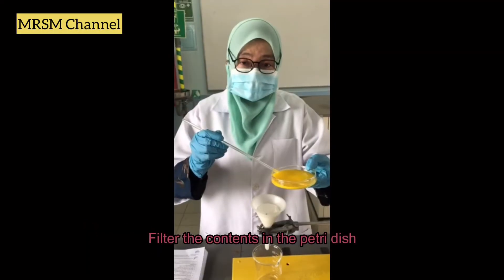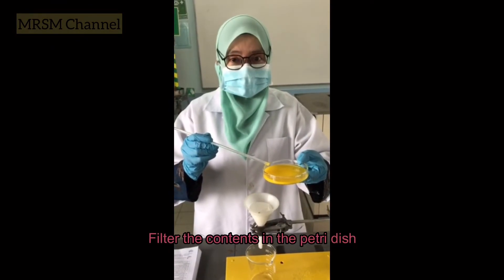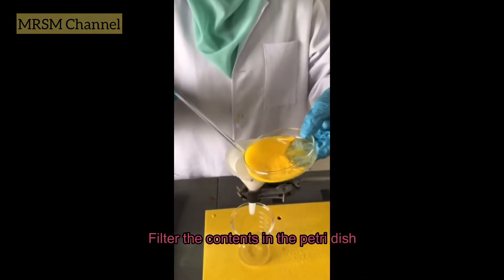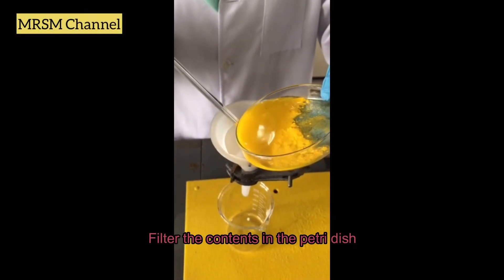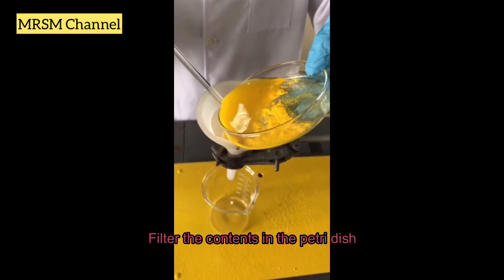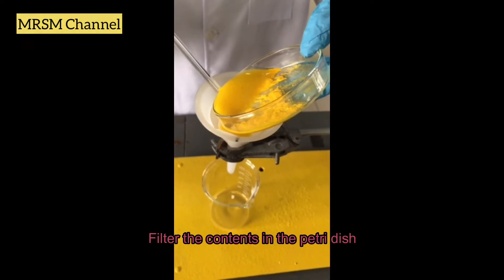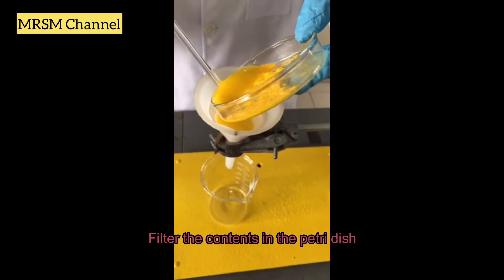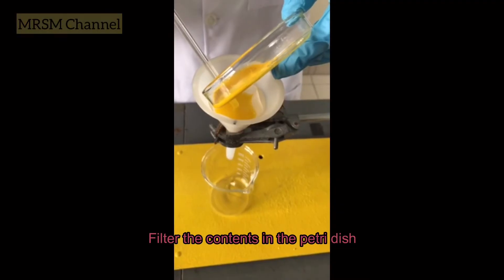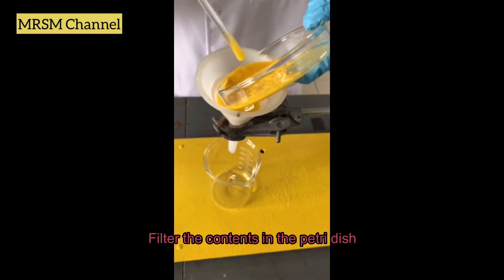Next, you want to filter the content using the filter paper. Pour it into the filter funnel carefully, because you don't want to spill the content out of the funnel. With the help of the glass rod, guide the solution through without spilling.